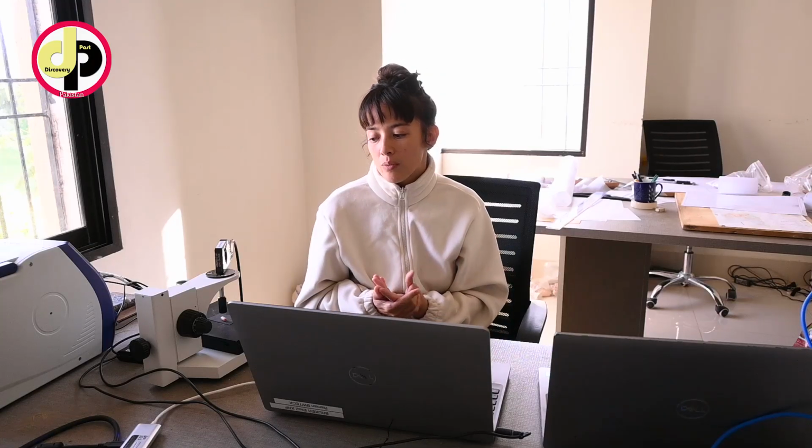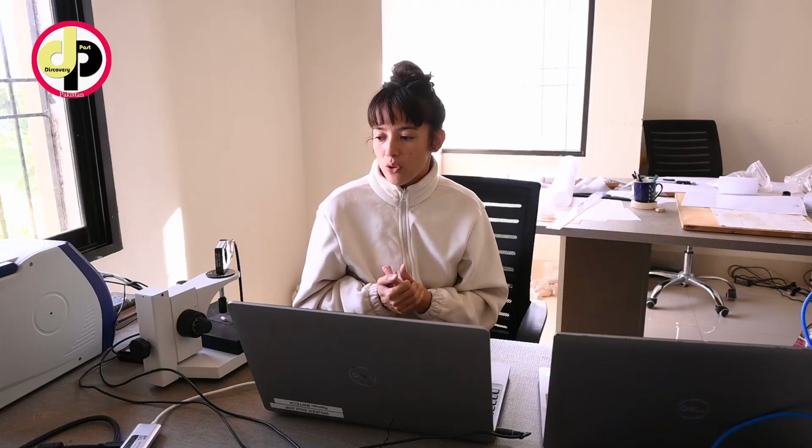So it's the first time actually that we are bringing some portable instruments on field, directly on the site. Usually those kinds of analyses are made in the laboratory, but the point of this first campaign is really to test, to assess the feasibility and the efficiency of those instruments to analyze those materials directly on field.